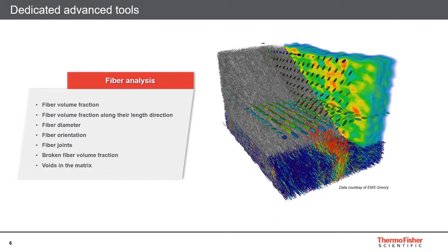You will also be able to obtain fiber density-related statistics, including volume fraction area and tensor per material subdomain. Avizo Software allows you to also generate a 3D plot of fiber orientation on a sphere or half sphere with properties mapped as color and height, in addition to using advanced fiber filtering modules. You can also easily apply meshing on your fibers and export results to major solvers file formats.